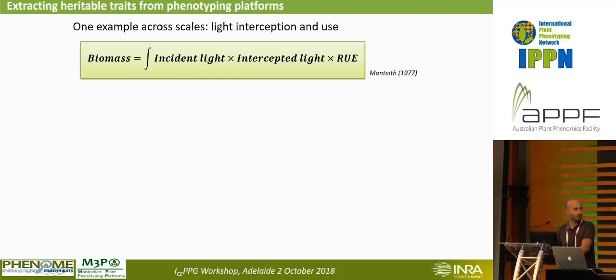So now I will talk about how we use this information with some modeling for extracting relevant traits that can be used in genetics or in modeling.